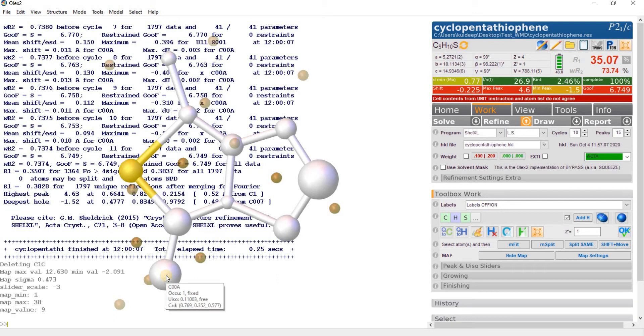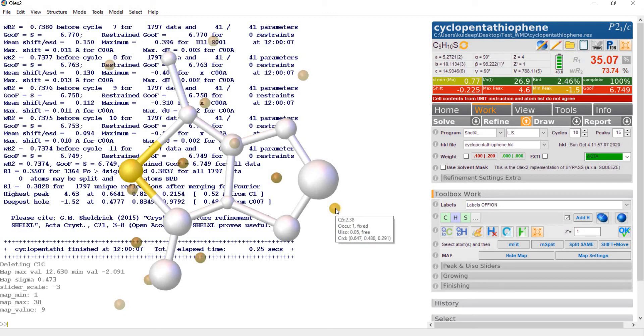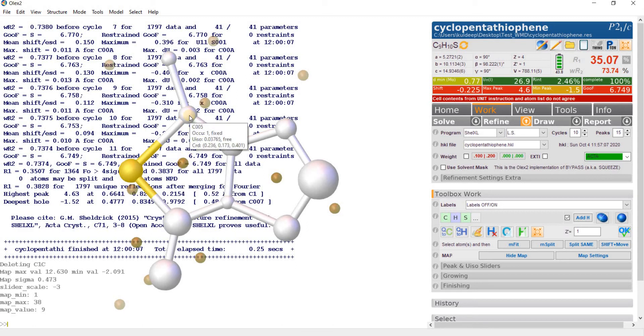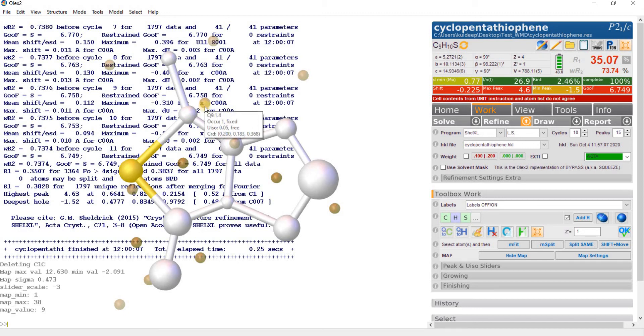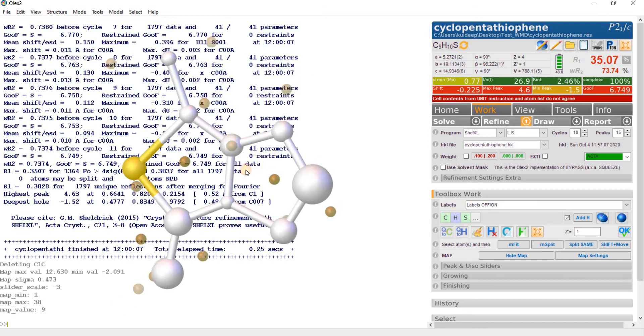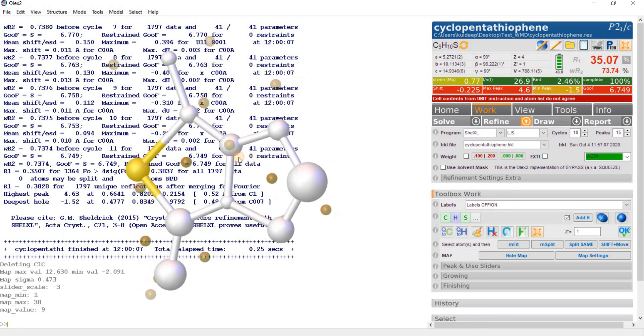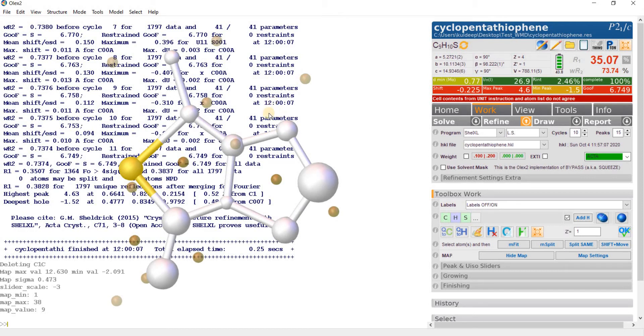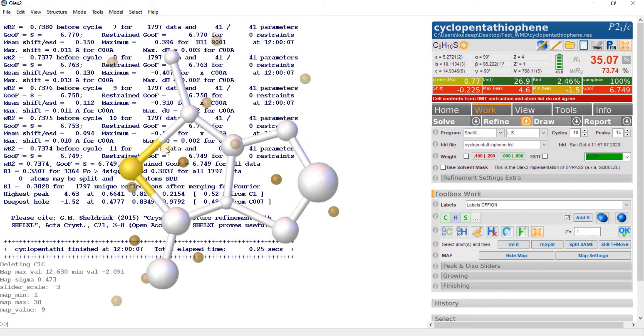At this stage the refinement is not going to help us, so don't refine right now. Let's visualize the electron density map of the molecule. Just press Control+M. There is large electron density about this carbon atom. There is electron density here, unassigned electron density, here on this sulfur atom, and here also some electron density.